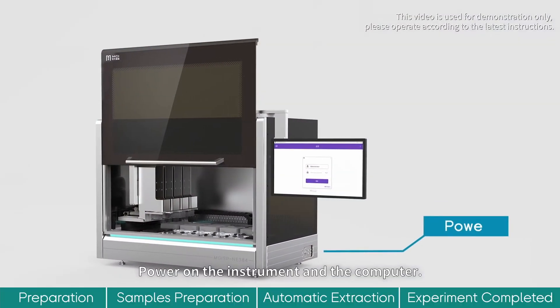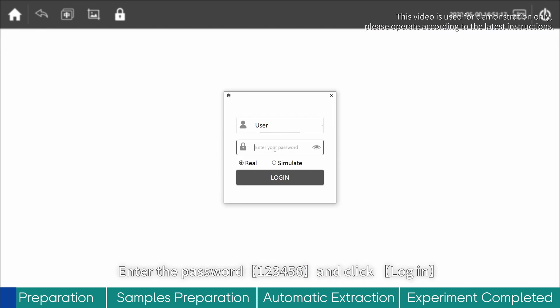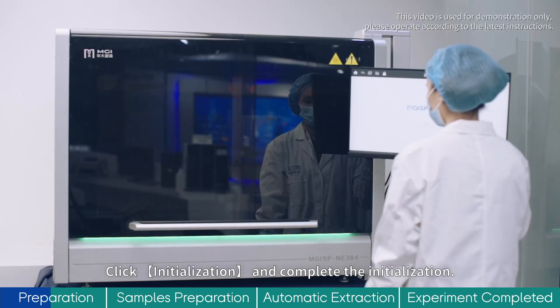Power on the instrument and computer. Open MGISP NE384, select User, enter the password 123456 and click Login. Enter the Initialization Interface, click Initialization and complete the initialization.